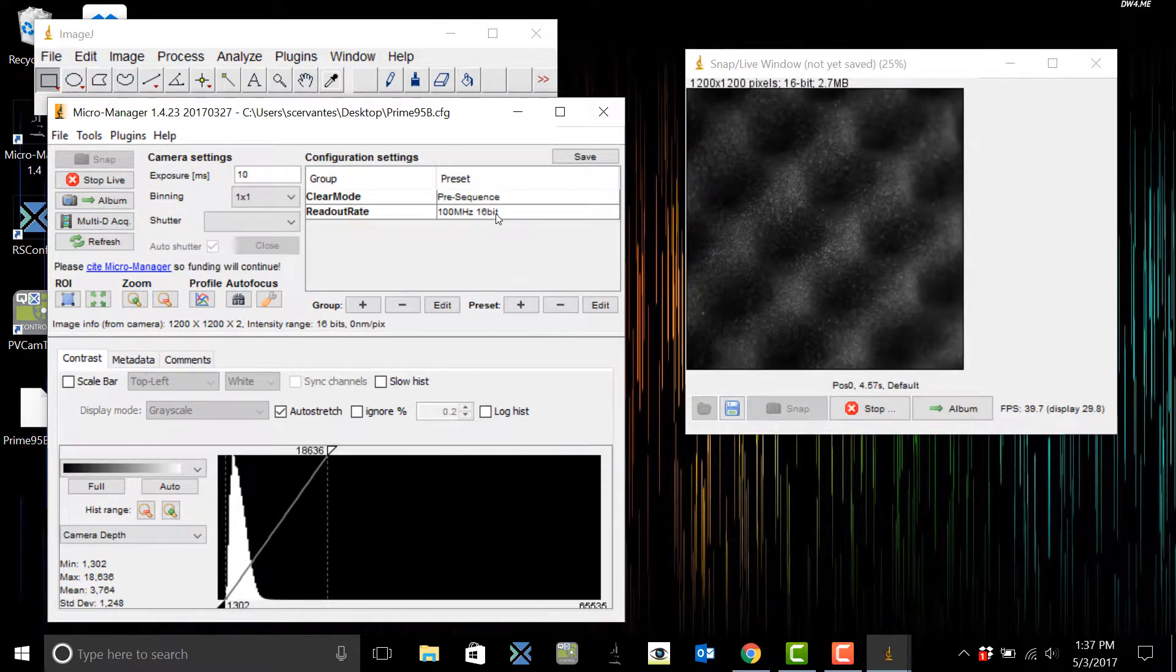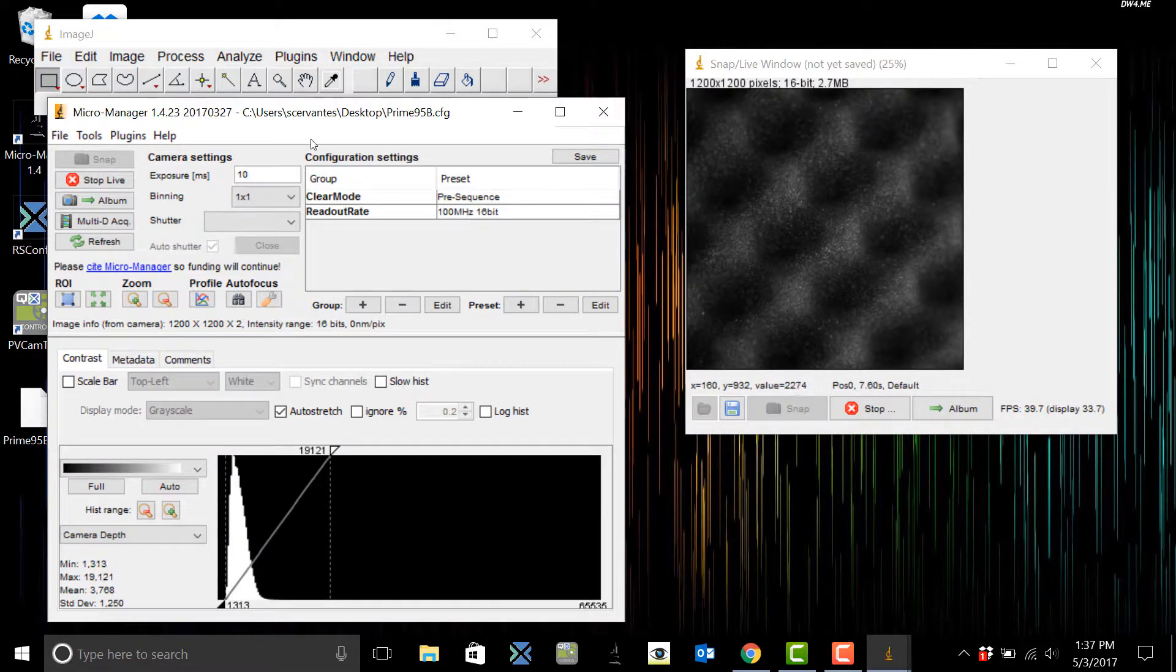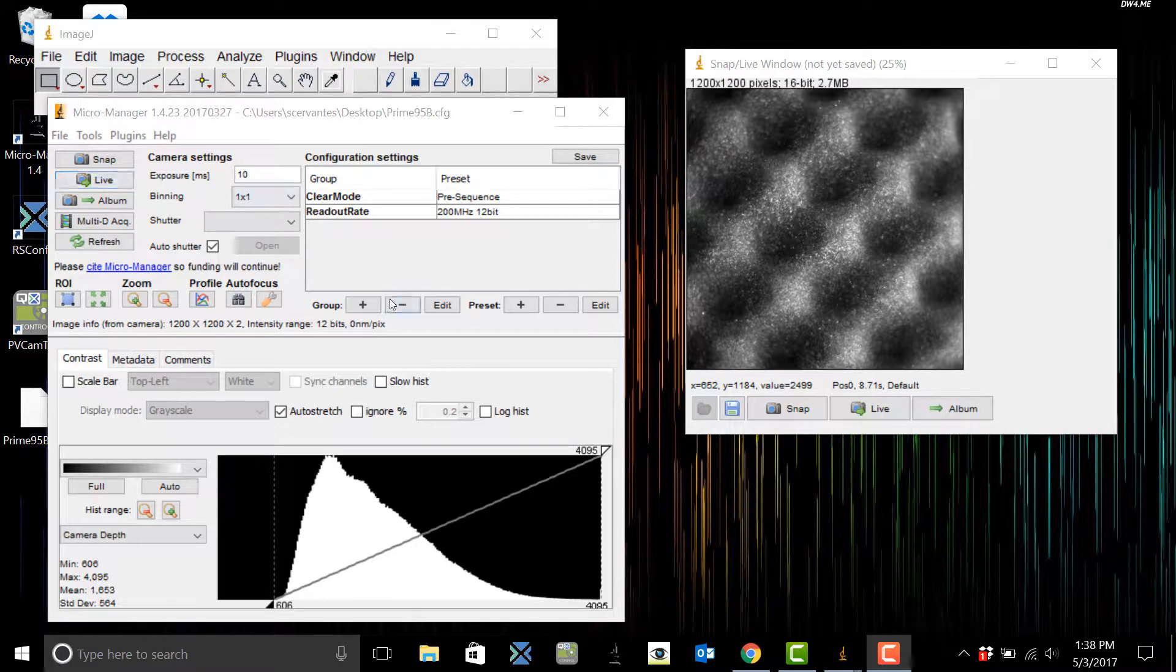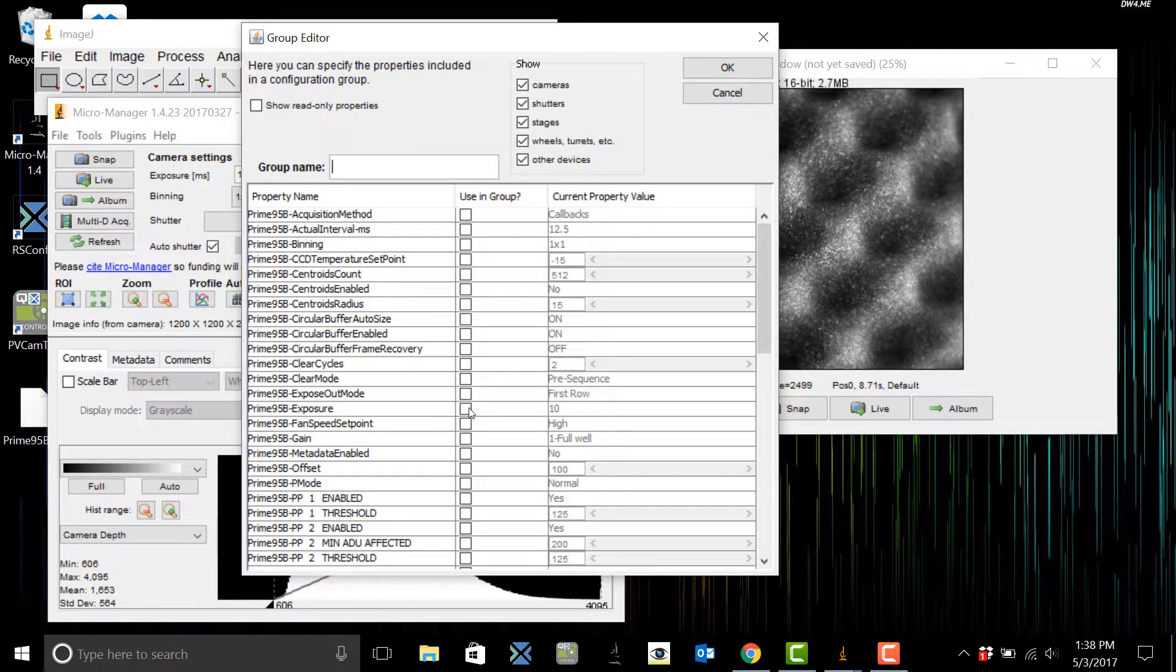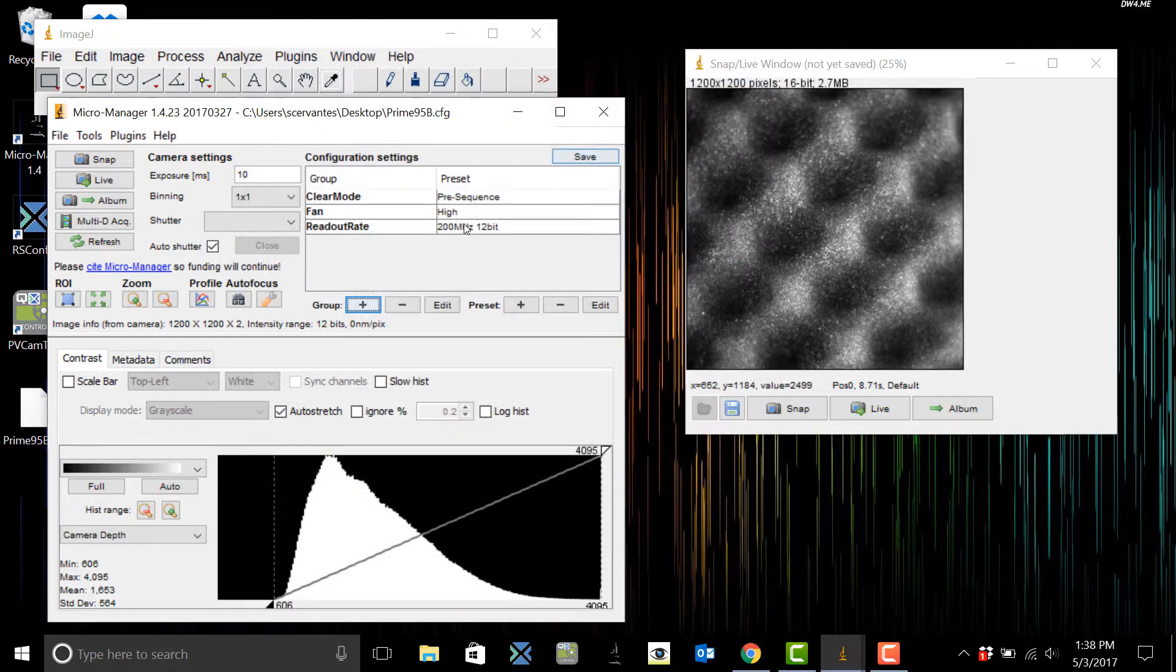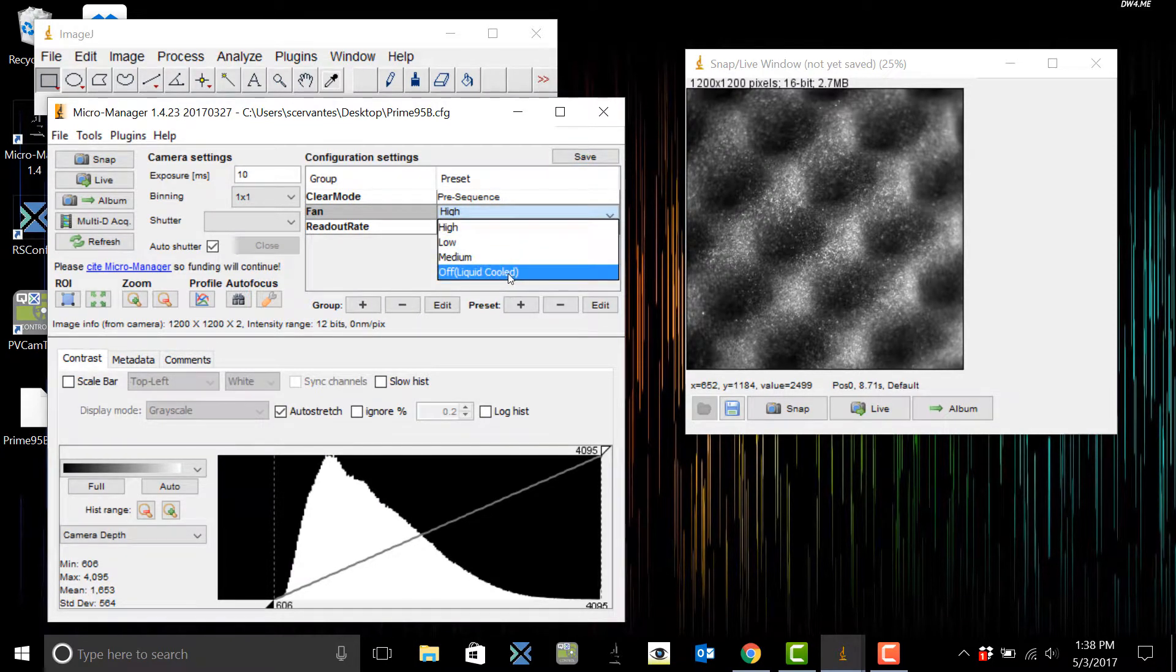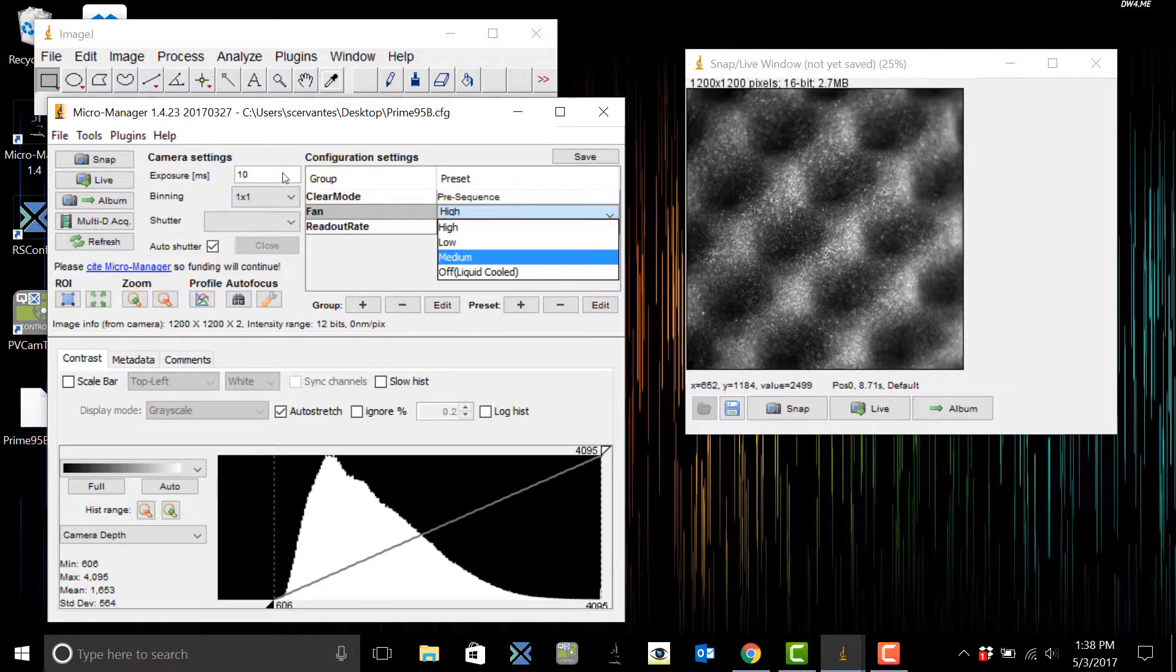OK, let's add another group. On the Prime 95b you have the fan speed option so you're going to be able to have variable speed control and you also have liquid cooling. This is going to minimize vibrations and also reduce the dark current even further.